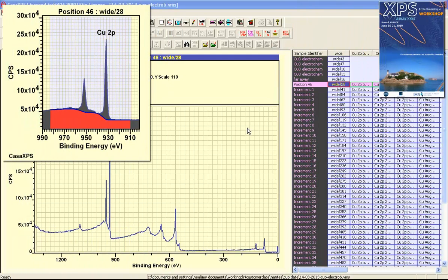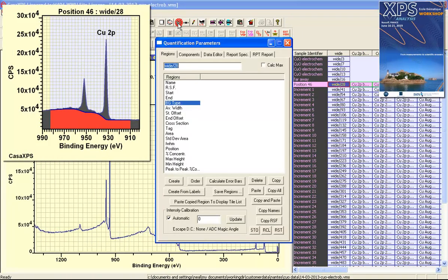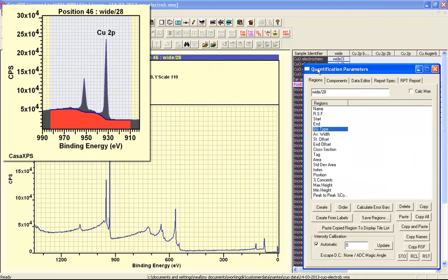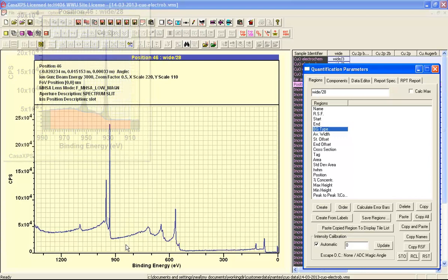In this video we are going to look at the quantification parameters regions property page and how quantification regions are defined in CASA XPS.